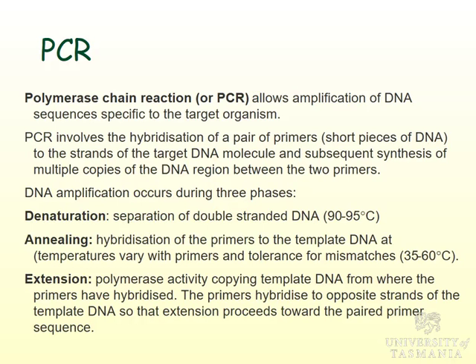I'll tell you a story, it was actually discovered by this guy, Kary Mullis, I think it is, in California. He was looking at ways to amplify nucleic acid. And the way nucleic acid is normally reproduced is you've got your nucleic acid with all your different codes. You get a short piece of nucleic acid that is homologous to one end. You add an enzyme, and the enzyme copies over and makes, so if that's an A, we'll put a T there. If that's a T, that'll be an A, C, and that'll be a G, etc.